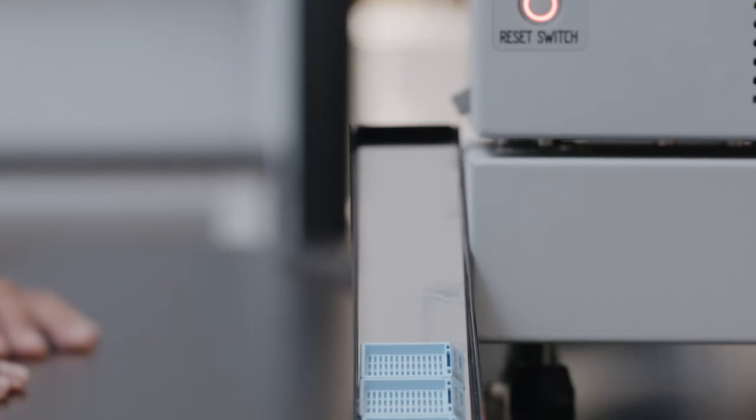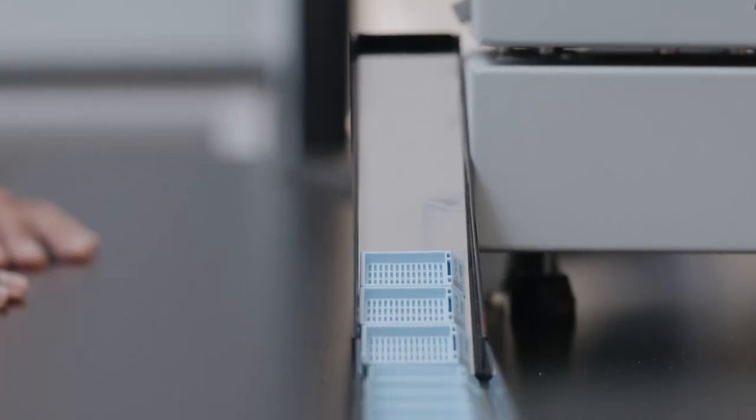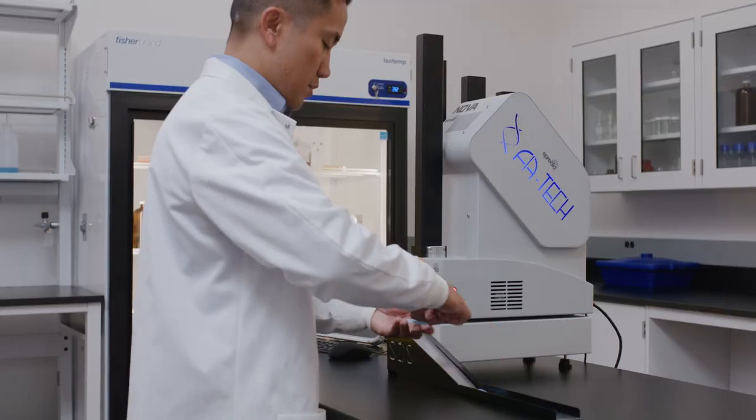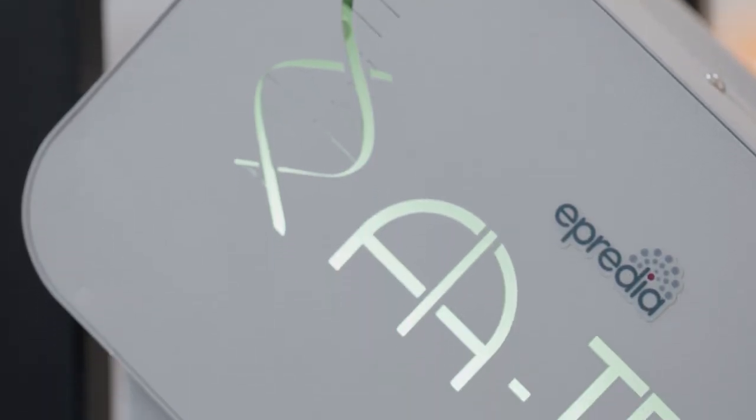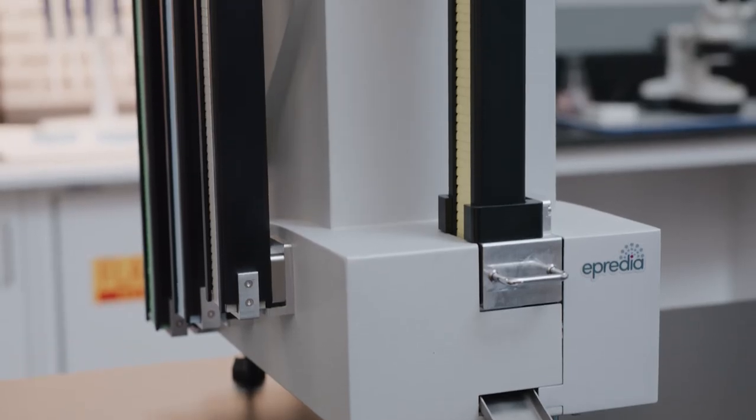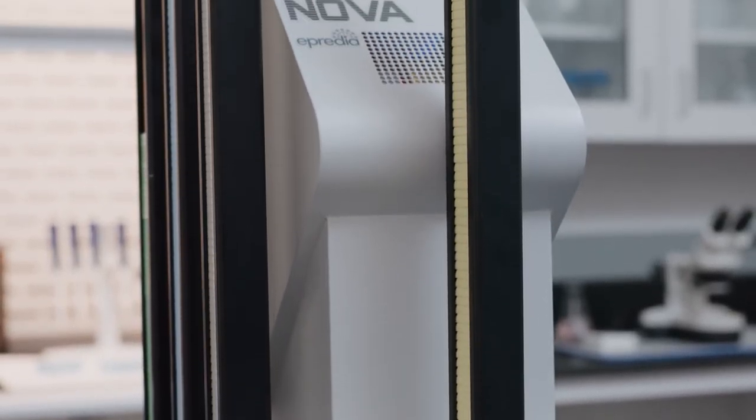Its laser technology eliminates the need for ancillary components such as print heads and ribbons, reducing cost, instrument downtime, and maintenance. The instrument also complies with all laboratory and laser safety regulations.